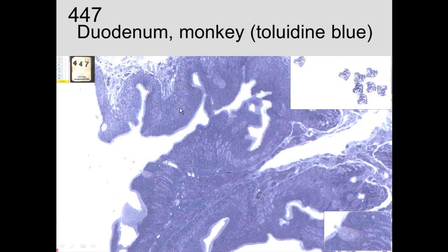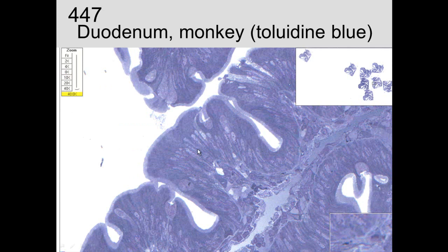These are the nuclei of those cells. Again, we can see it at a little higher magnification. So this would be an individual cell that will go in through here, a columnar cell. These are taller ones as you can see right here. These are the nuclei of these cells, the brush border. These are the secretions of the goblet cells that are located in there.